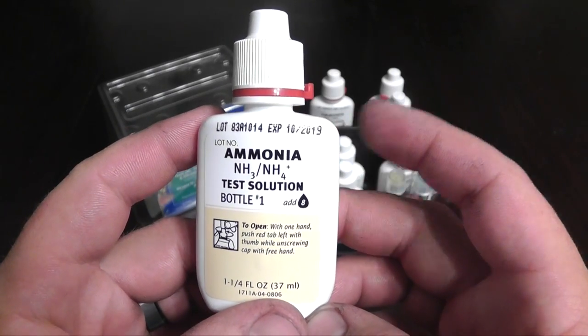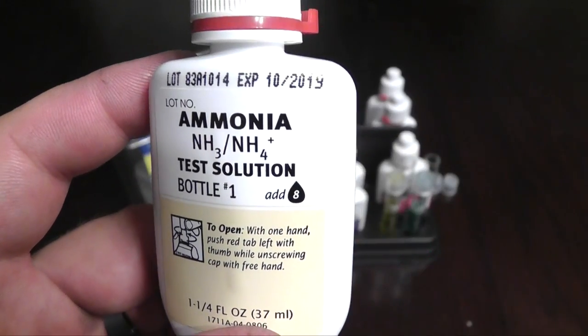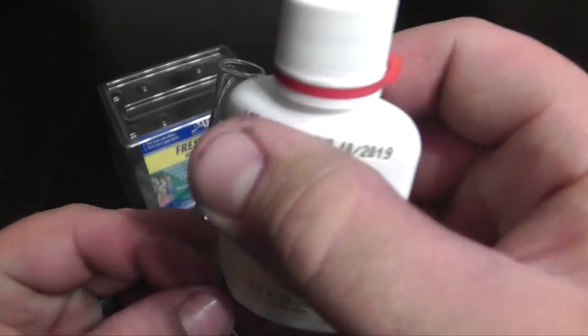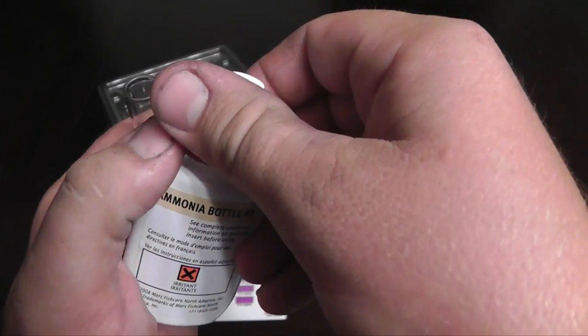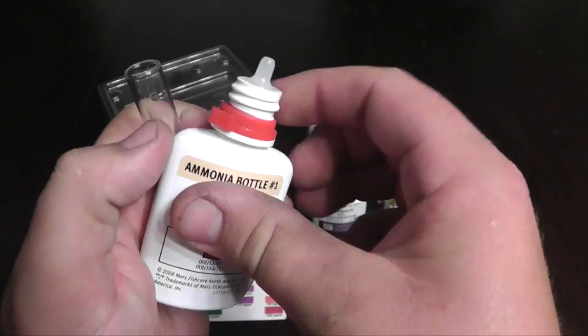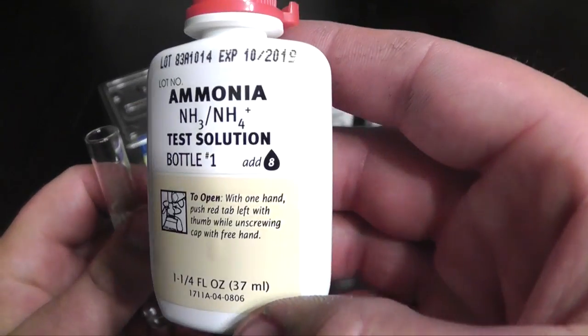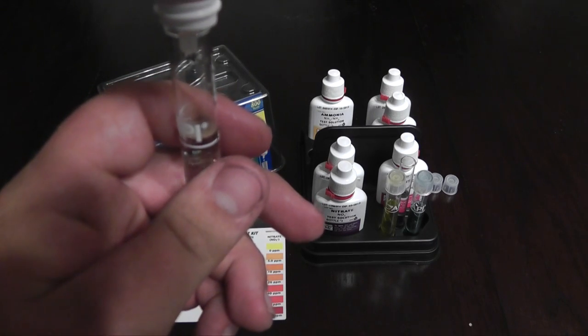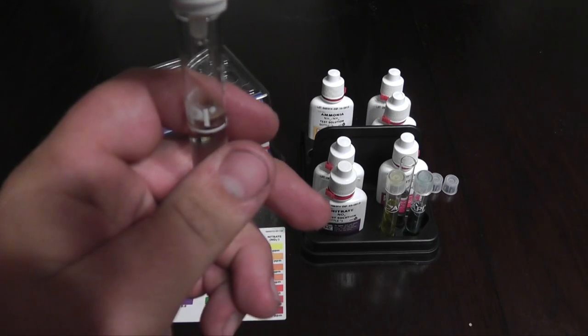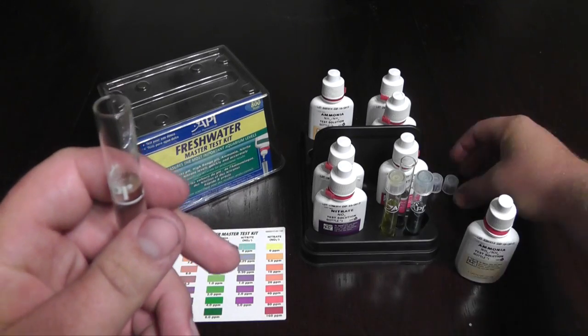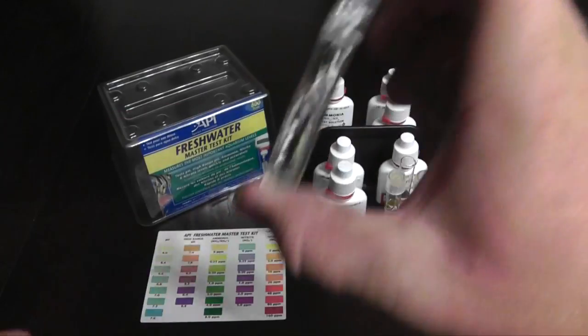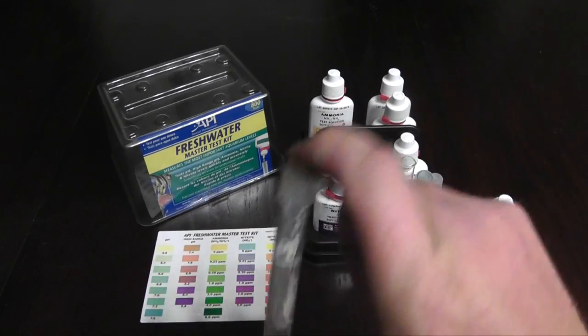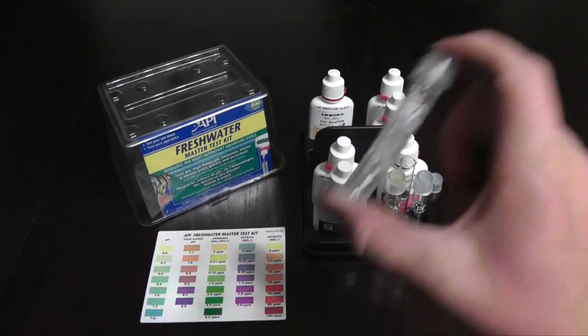Next, you want to add eight drops to your ammonia test tube. So let's go ahead and do that. Like I said, eight drops. You can see right there. And then you shake it up. Because this one has two bottles, sorry. Two bottles that you test with. Shake this one up a little bit. And then you can grab your second bottle.